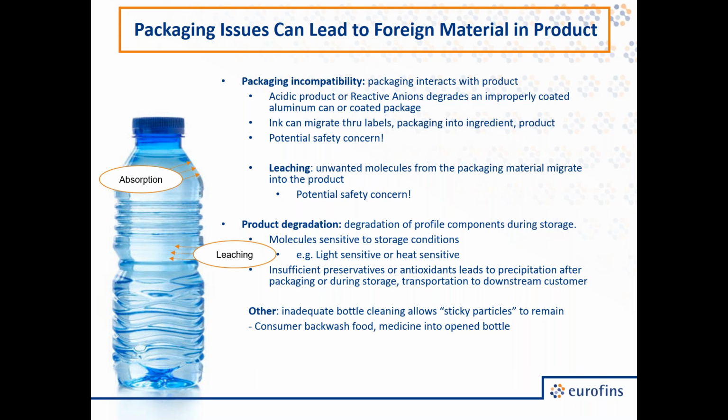Aside from packaging incompatibility, could be leaching. So the packaging is causing a component to leach into the product itself. One example of this that we're all familiar with is BPA.